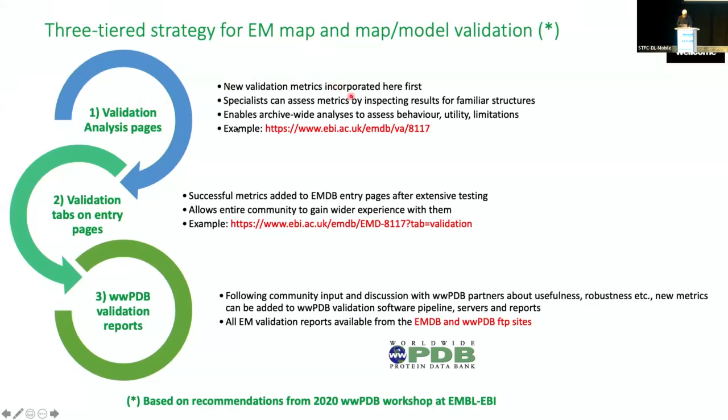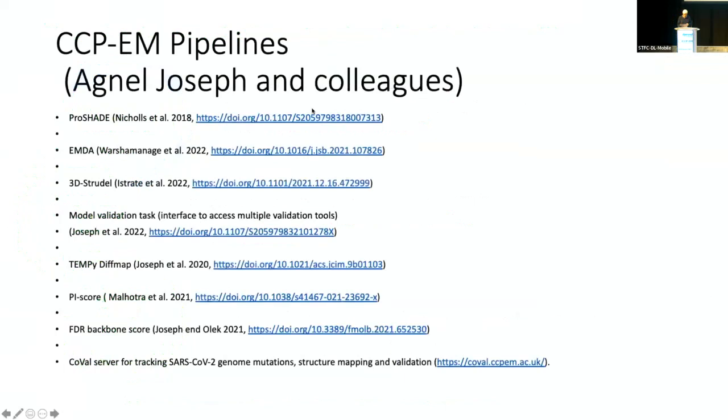But the point is, anyway, our colleagues at the EMDB also have a procedure for bringing these validation tools online so the community can assess them. And in addition to the deposition side, of course, our host for this meeting, CCP-EM, is building these pipelines for structure determination, and of course, validation has increasingly been part of their focus.